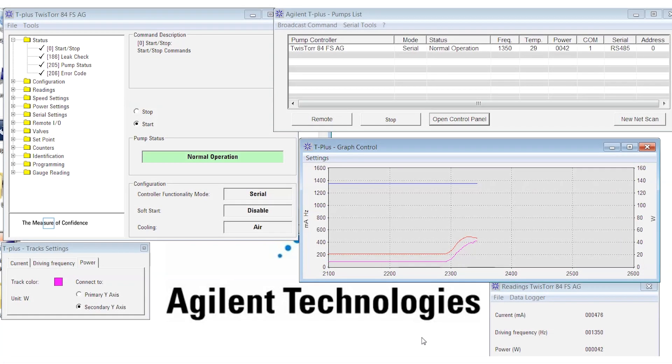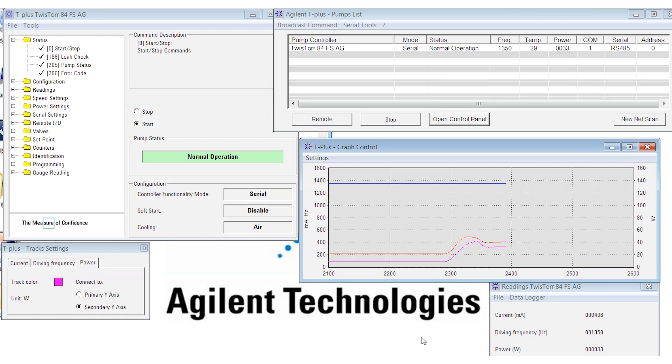So you can see right away the increase in power and current drawn by the pump. Since the pump is doing more work than before, we can expect an increase in bearing temperature. But since temperature is a relatively slow parameter to respond, it may take some time to see this effect.